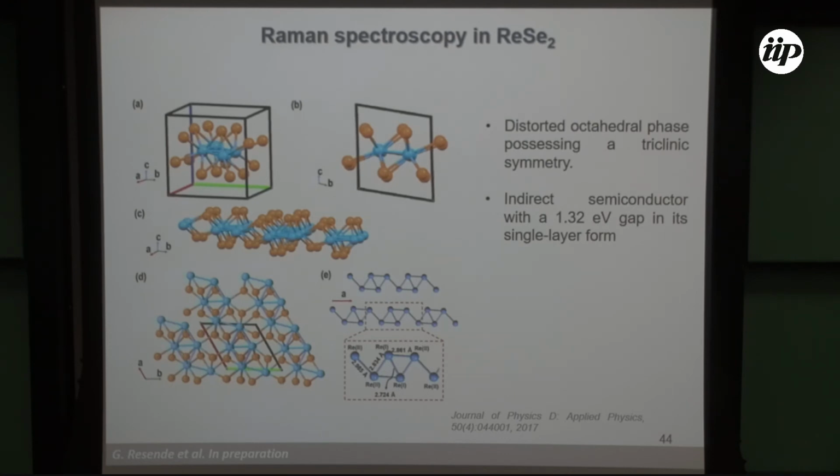They just do some unpolarized measurements, like just rotating the light or rotating the sample without worrying about the orientation of the incoming and the outgoing beam. And they say, okay, I got 16 Raman peaks, and that's all. I don't know where the other 2 are. And we were trying to see if, by doing properly polarized Raman measurements, we could see that.